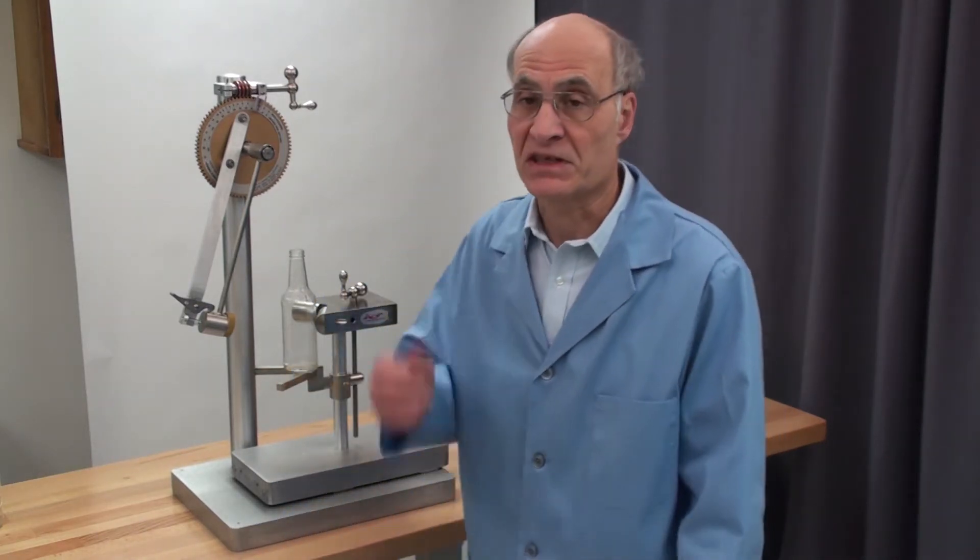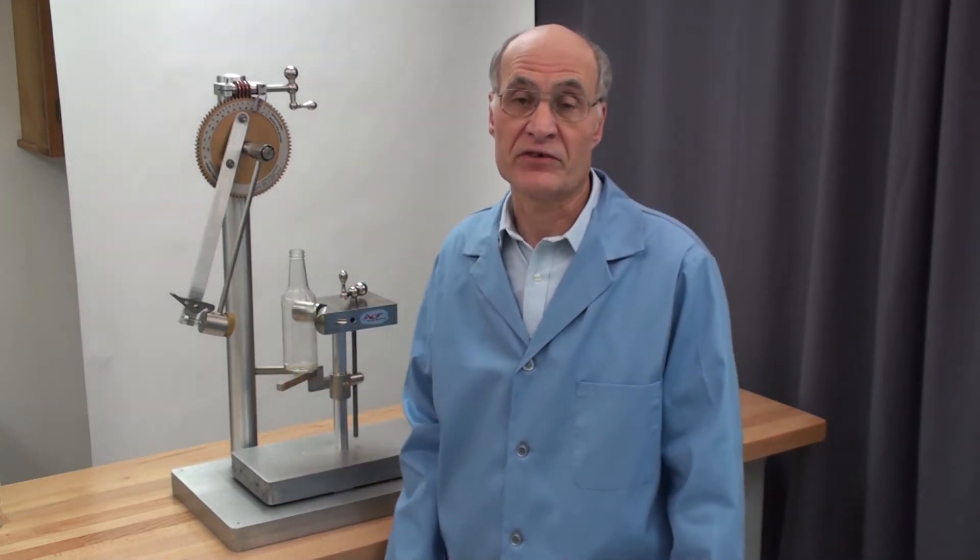One of the nice things about the potential impact tester is that you can use it to duplicate fracture patterns of bottles that broke in a filling line or in trade.